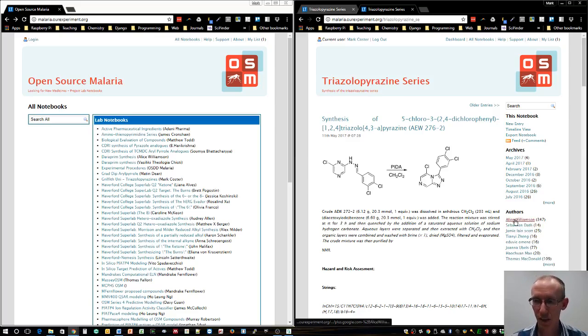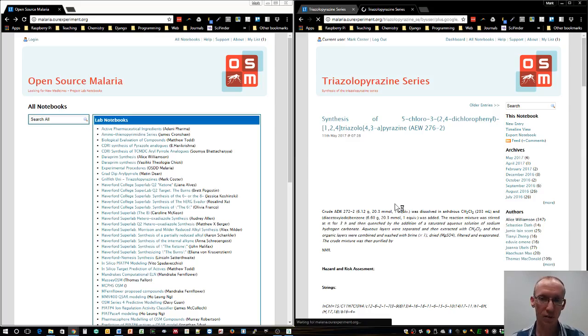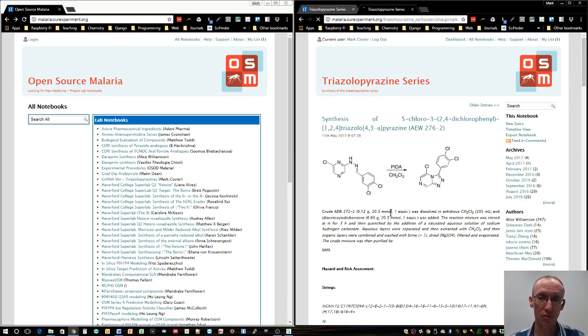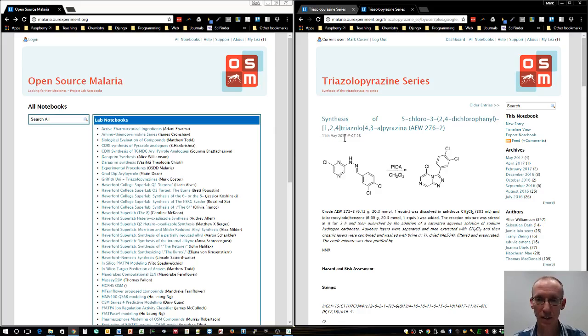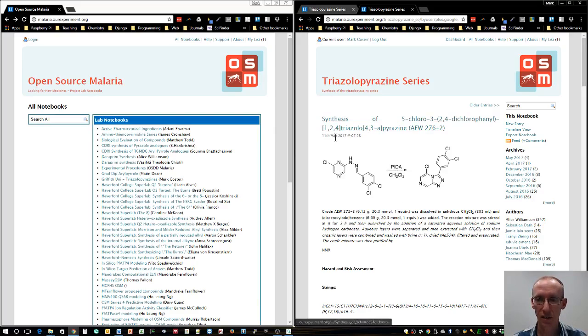If you click on Alice Williamson, you can go to all her lab book entries. You can see she's been working on it as recently as the 11th of May this year.